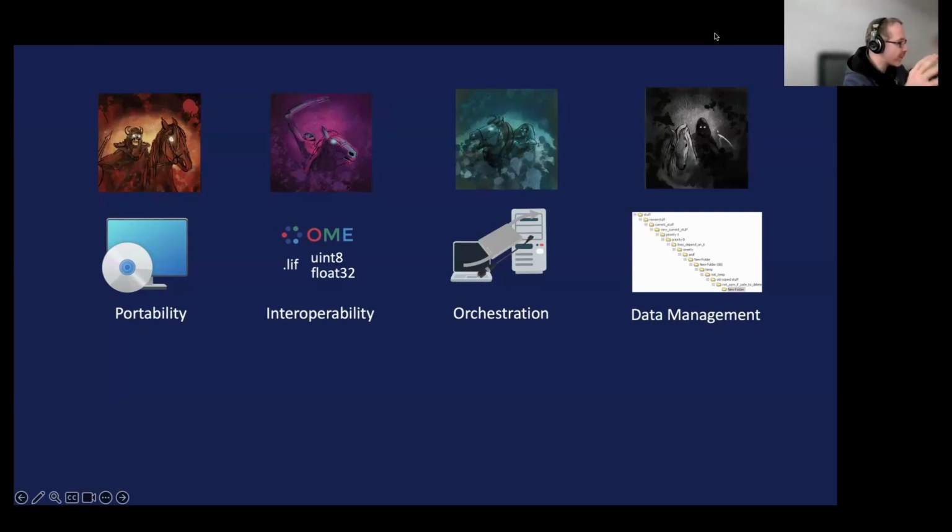Another question: when you install Arkitekt, I think it's operating system agnostic, so you can have Linux, Windows, or so for the server too. We just need a virtual machine environment, for example Linux, and I can put all of my Arkitekt on it. And I need to install my Napari, and I need to install my Fiji and connect it.